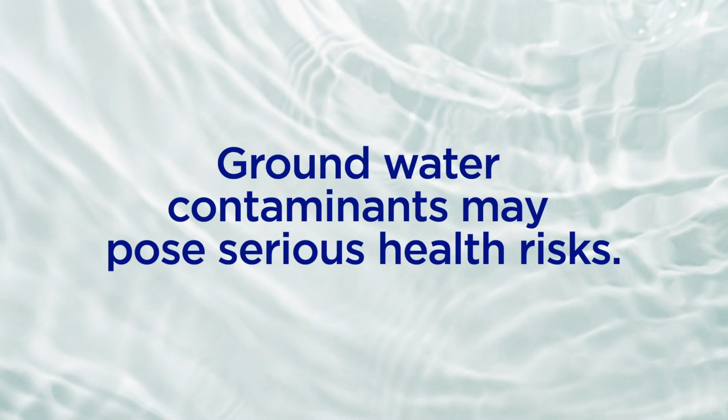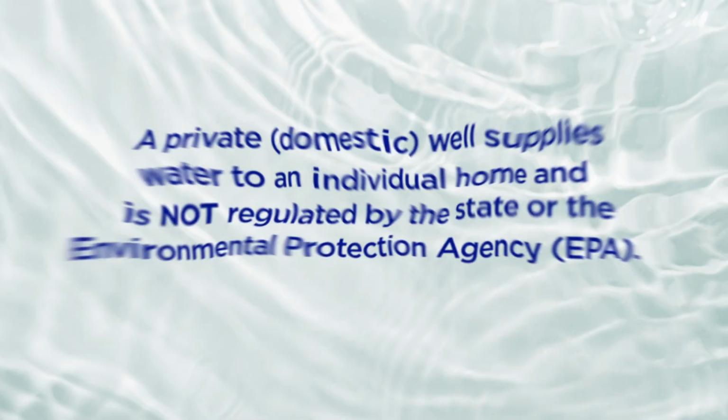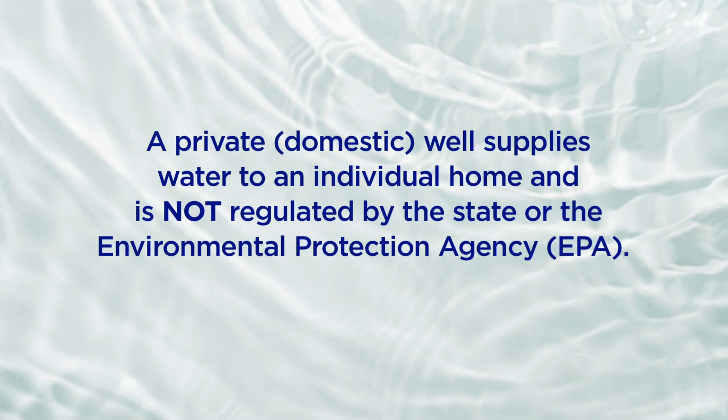These contaminants can be naturally occurring or human-caused. The Idaho Environmental Health Program has provided this video to guide you through the simple process of taking a water sample so you can make informed decisions about your drinking water or treating if necessary.